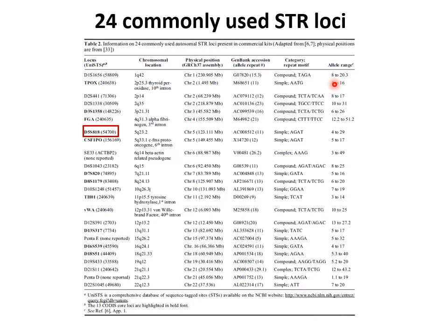So for instance, let's analyze one particular locus, D5S818, it's here. It's located on chromosome number 5, so 5q23.2, the exact position. The sequence which is repeating is simply the AGAT sequence, and we can expect from 4 to 29 repeats of this particular sequence in this particular locus.